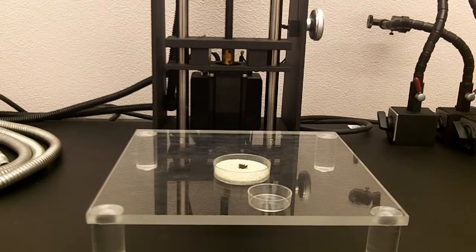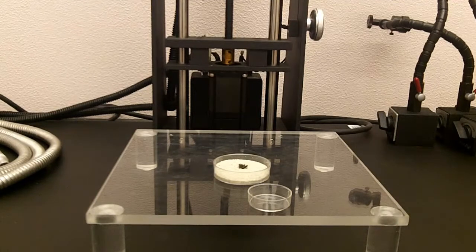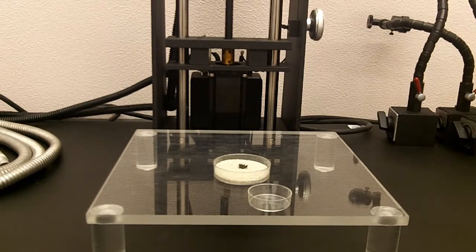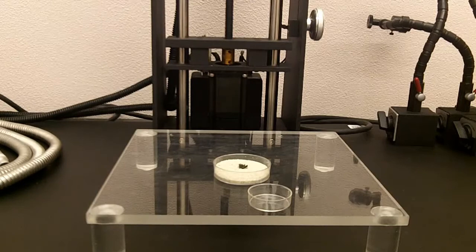But that can always be remedied by having a different kind of shot. So say you did a dorsal shot and information was hidden, you could switch the specimen around and do a ventral or lateral shot. Really, whatever you prefer.